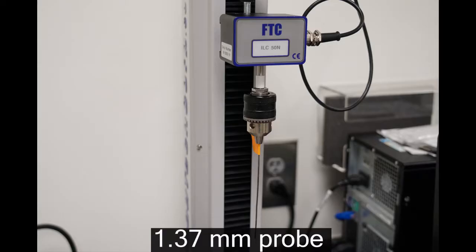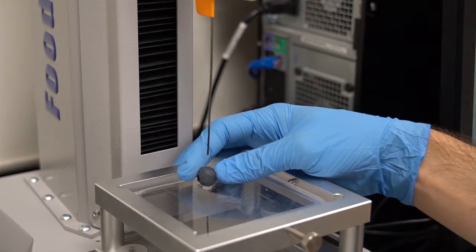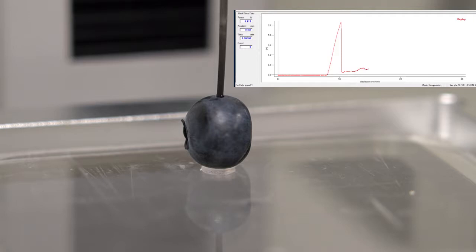To measure skin strength, this probe is used to puncture the skin on both sides of the equator end. The berry is placed against a stationary hard surface with the probe traveling at a constant speed. This puncture test provides an objective measurement of what it feels like to bite down on a single berry. The probe senses the opposing force of the berry until the skin is penetrated, entering and exiting the berry. The maximum force or max load required to puncture the skin is measured and recorded.